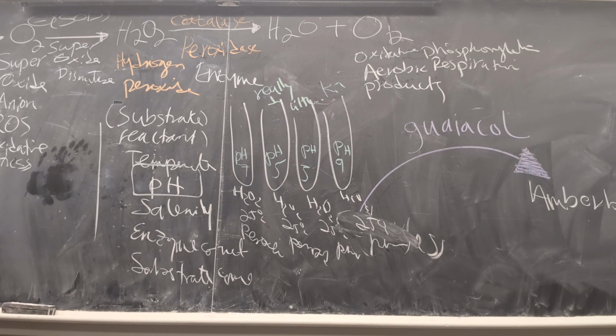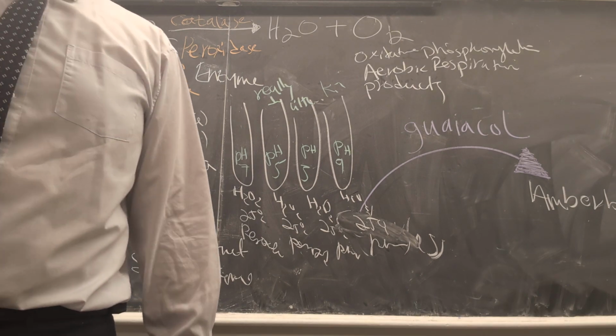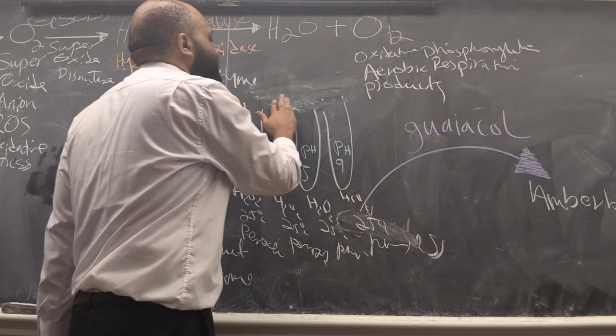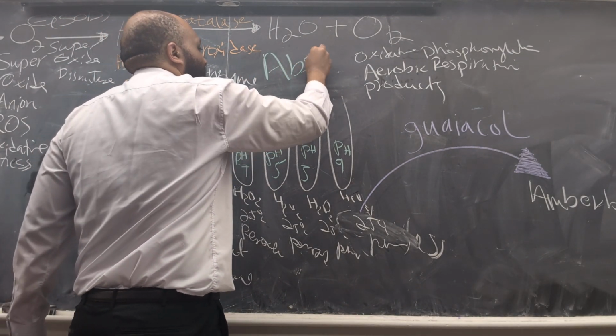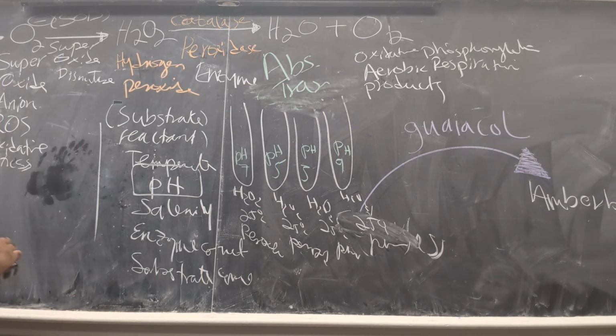If you want to say it's really, really dark, how would you say extremely concentrated? But we're not going to do that either. Why not? Excellent. We're going to use the spectrophotometer, and we're going to replace all of this with absorbance values. Absorbance, and transmittance. So, what does that mean?